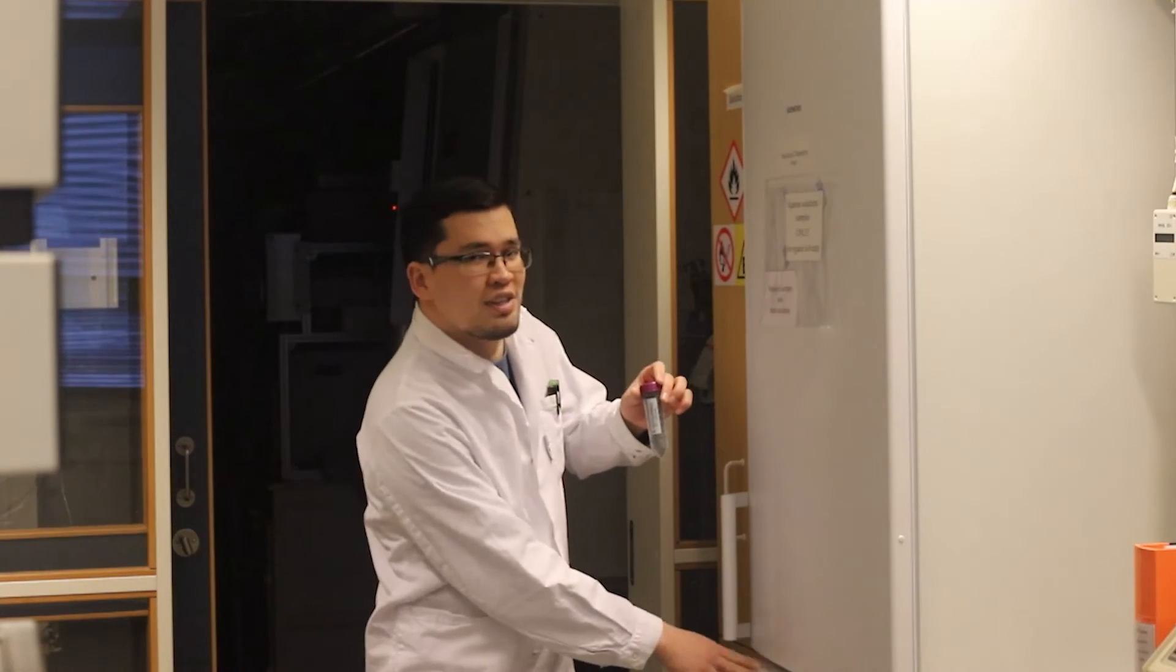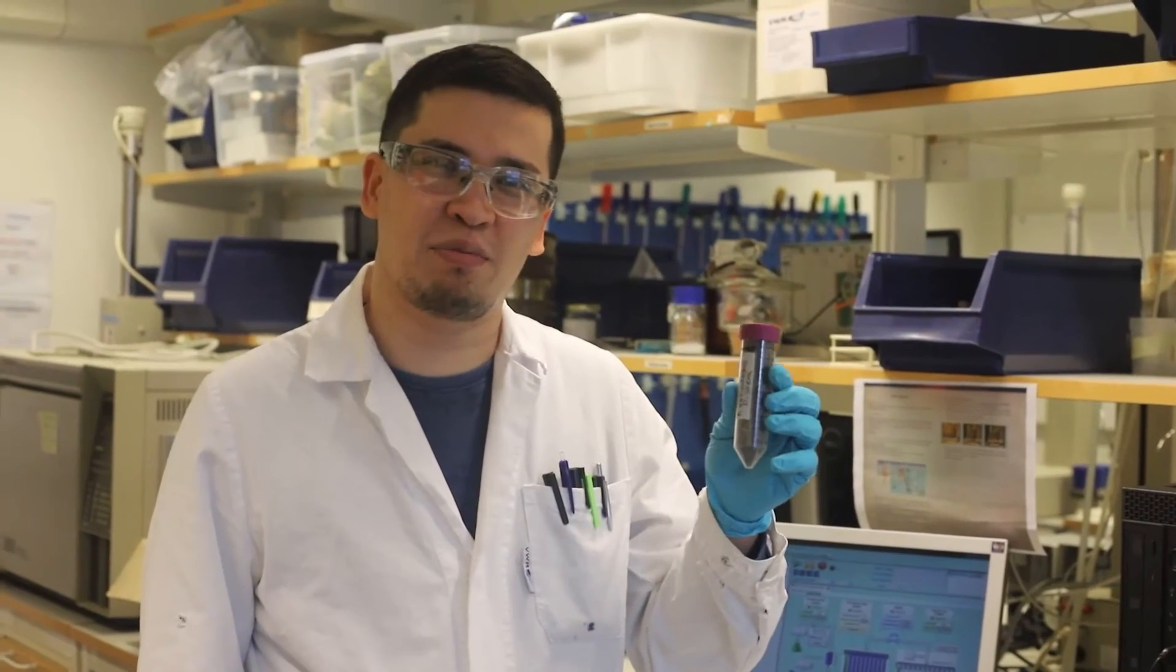So here is a sample that I have, and it's a brown seaweed, and it's named Fucus vesiculosus. Okay, this is the sample, the seaweed sample that I showed you before.